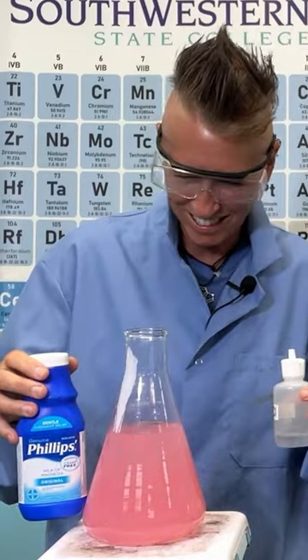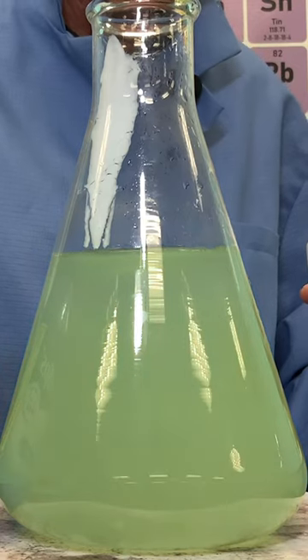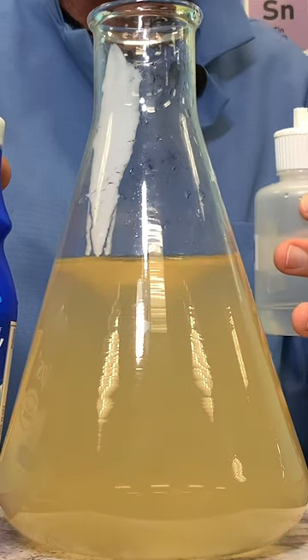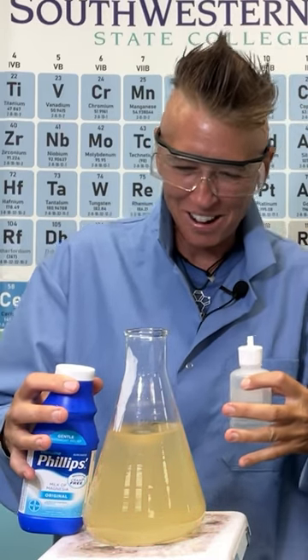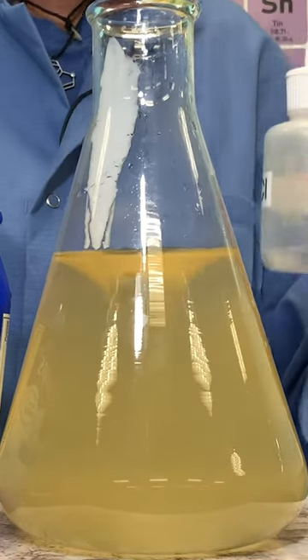The hydrogen ions from the acid combine with the hydroxide ions from the base to form water. The remaining ions form magnesium chloride. As hydrochloric acid is added, it momentarily turns red, indicating strong acidity, but gradually transitions through various colors. The net result is the initial precipitate of magnesium hydroxide becomes more soluble as the acid is neutralized.